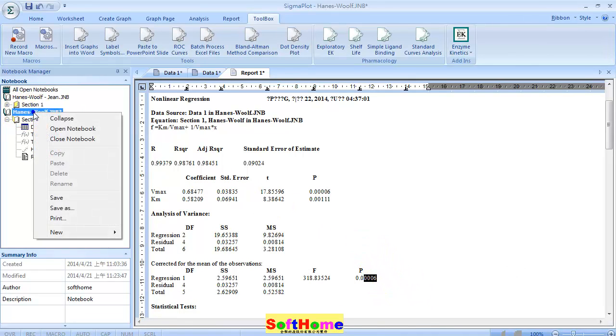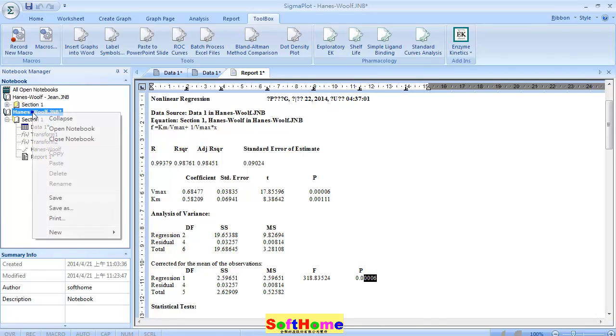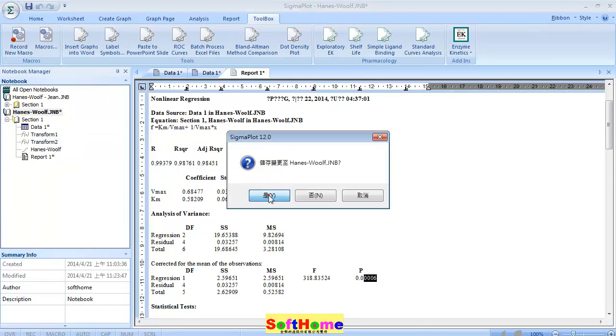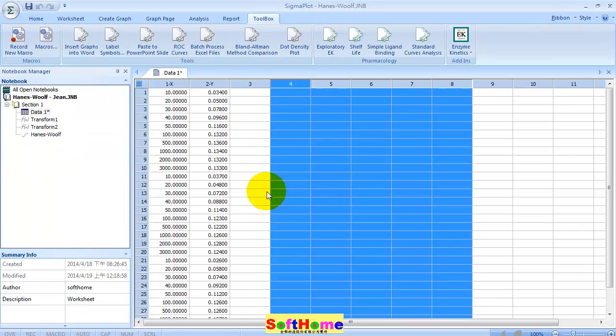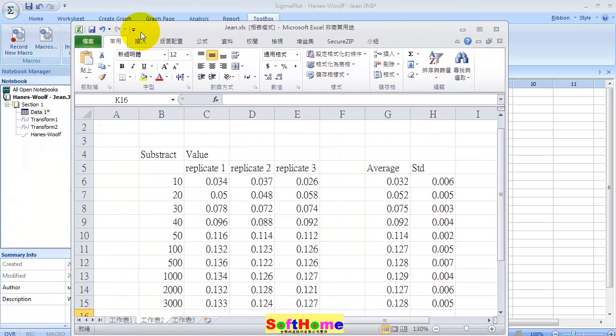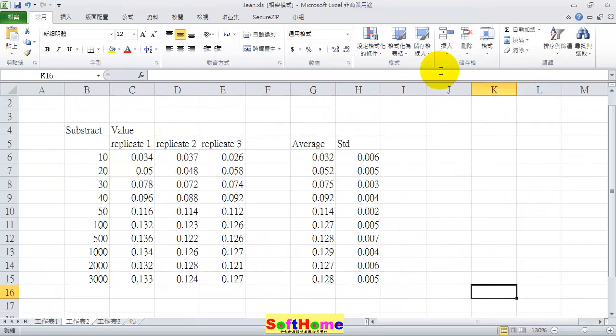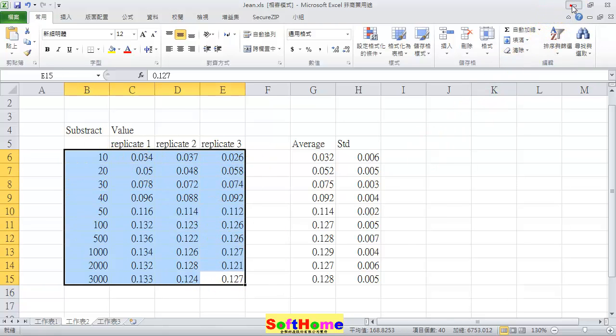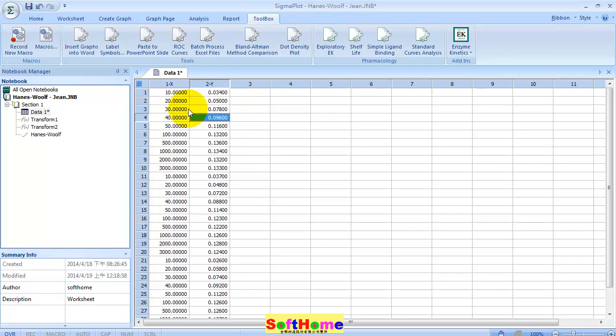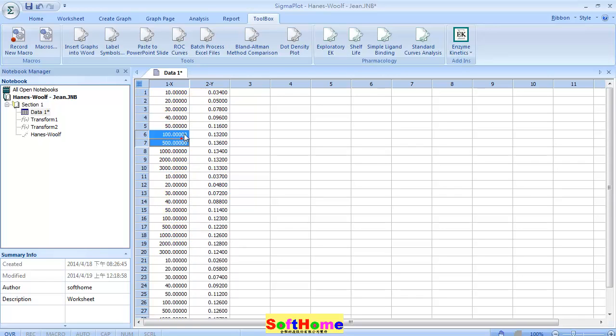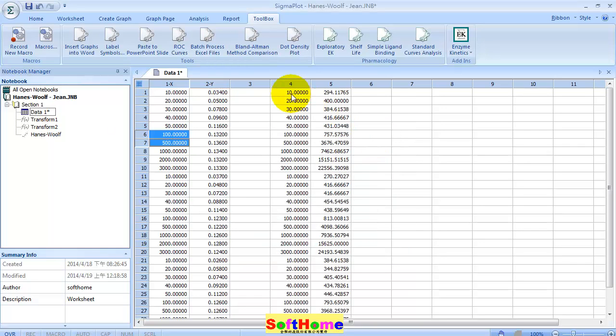Now I will show you the real case. This is the real case. Actually in the experiment it's like this, but we just need this data. Rearrange your data like this one. Still the same, use transform one and press run. The data points are in the fourth and fifth column.